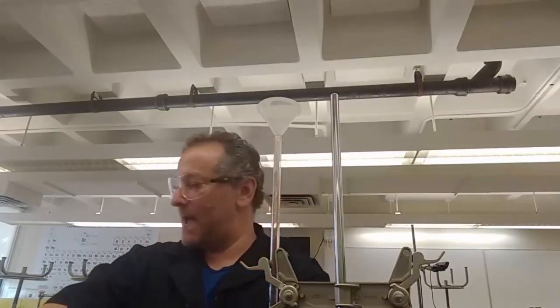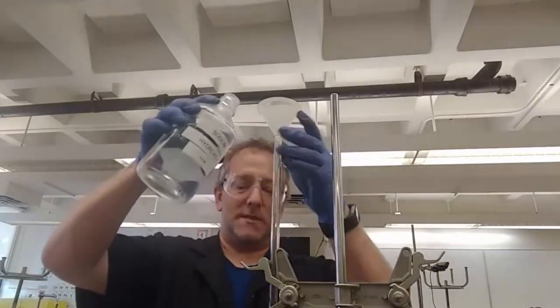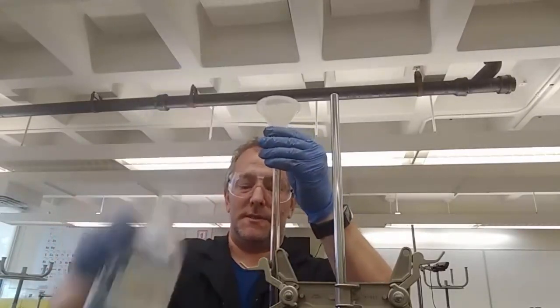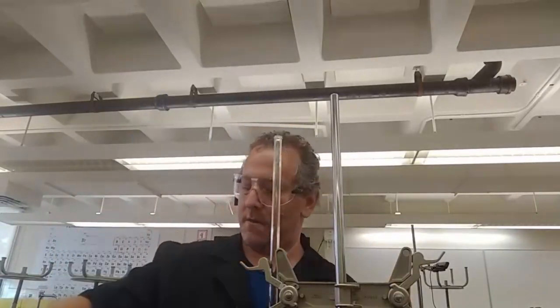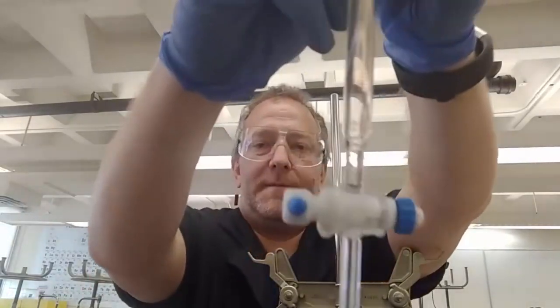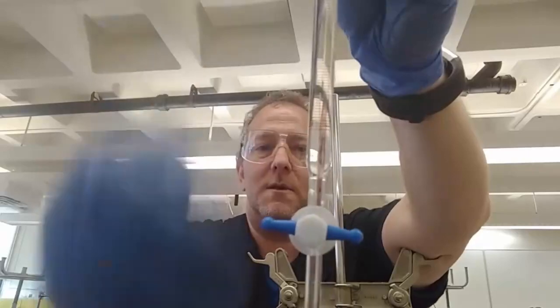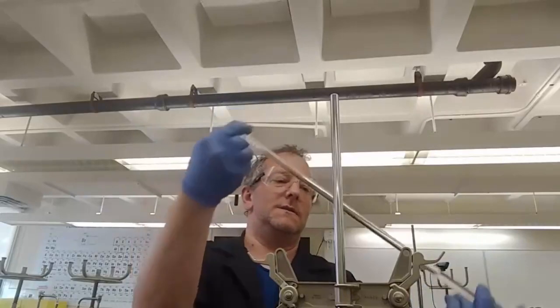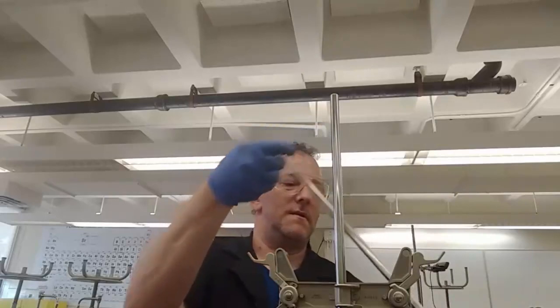I'm going to rinse my burette with some sodium hydroxide, just because it hasn't been used in a while. So here we go. I'm just going to add a couple of milliliters. This is not in the lab manual, but I want to do it just to be safe. The valve is off. Whichever way the handle faces is the way that the hole is. So the hole is that way. No liquid can come out. So I'm just going to put my finger over the end and really coat the inside of the burette with the base.